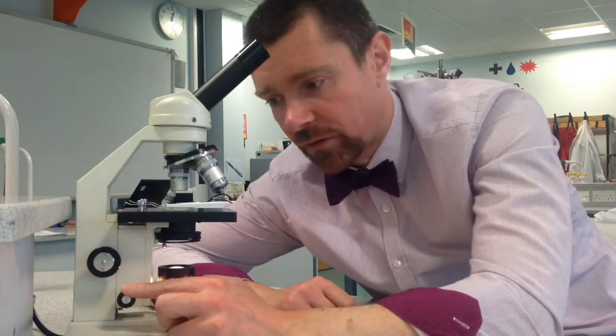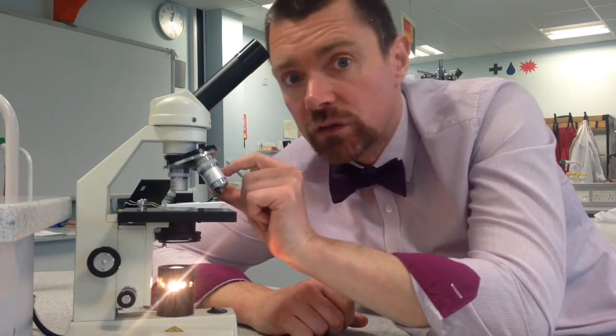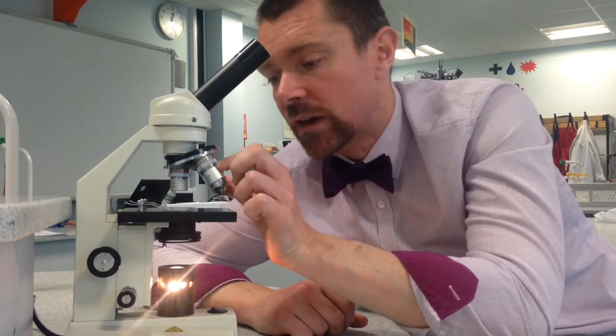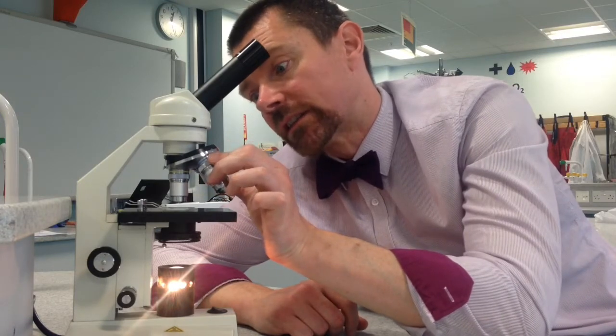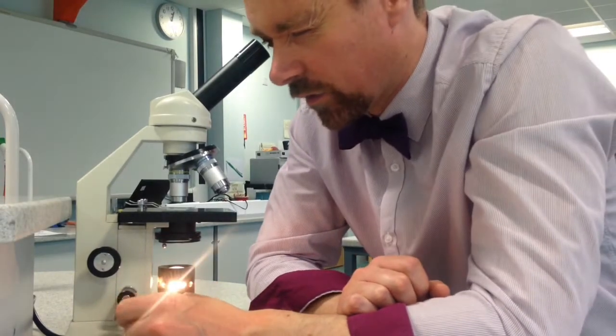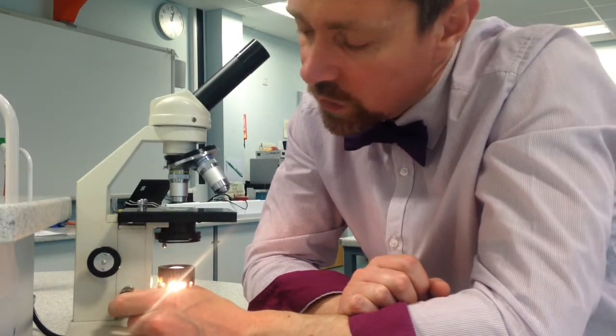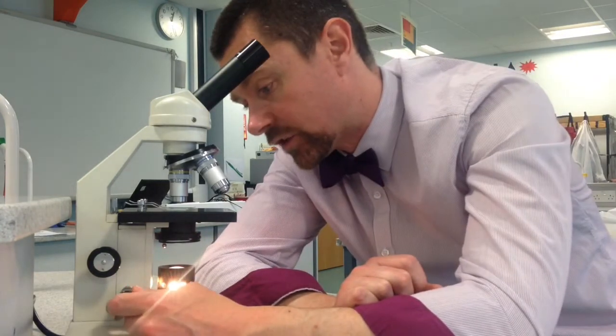Once you've done that with the fine focus, you can then start to zoom in by using the next most powerful lens. We turn the revolving nosepiece until we've got the second most powerful lens in place. Then again, we look through the eyepiece and we can use the fine focusing wheel to get a really clear image.